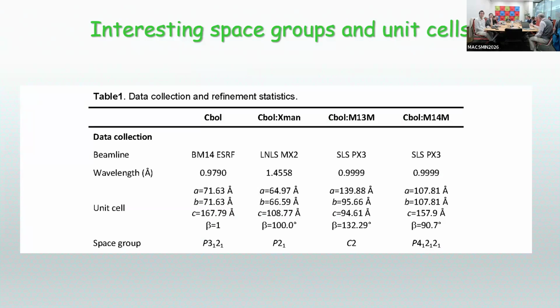We find some interesting space groups. If you look on the right, that it's not in the PDB, that's in the paper that I had on my desk, and you can see a tetragonal space group with a beta of 90.7 degrees. Have we not heard about symmetry here? Yeah. So you don't get in a tetragonal space group a 90.7 degree angle.